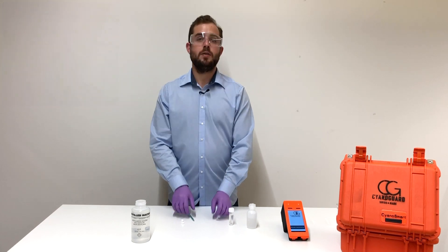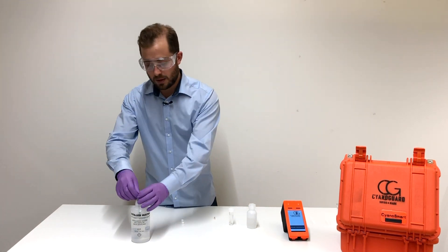To avoid any carryover, let's rinse the cartridge quickly with some clean water.